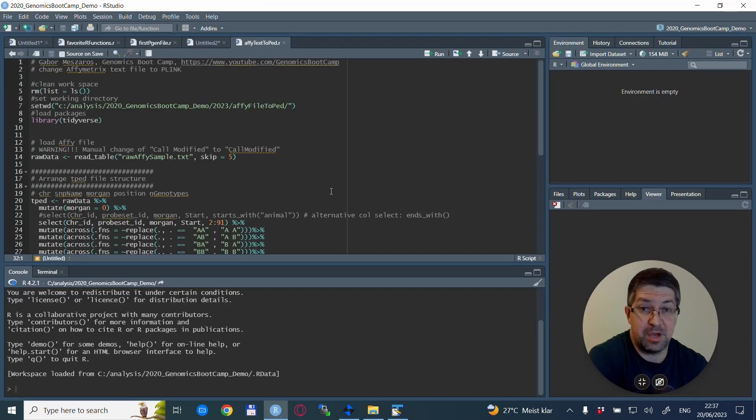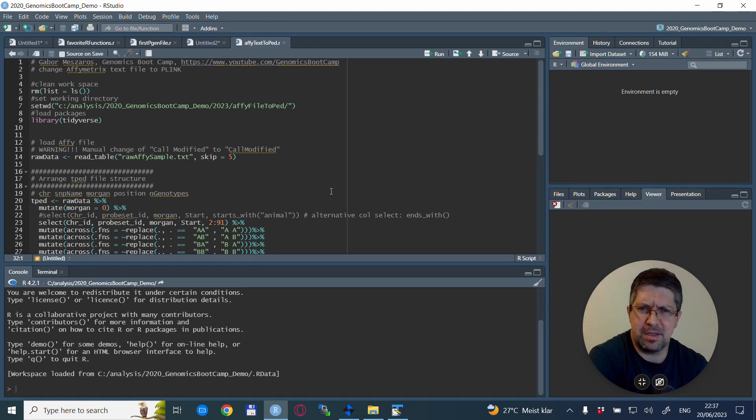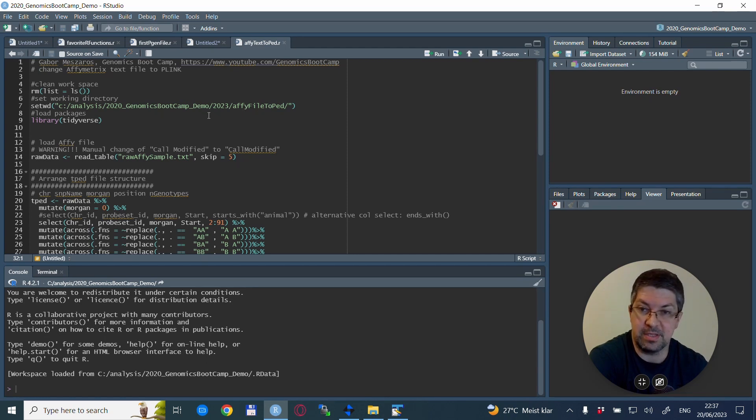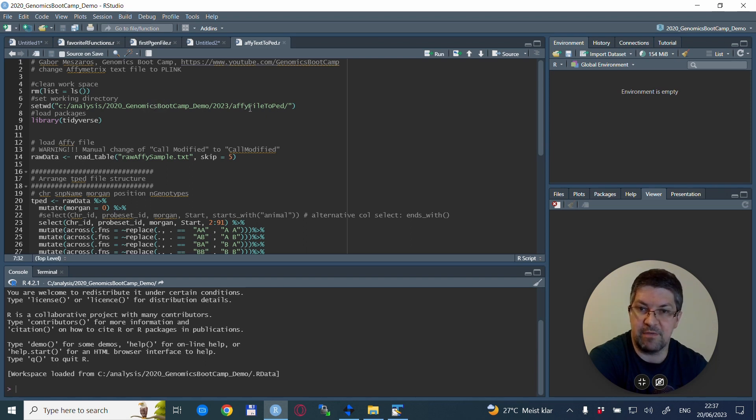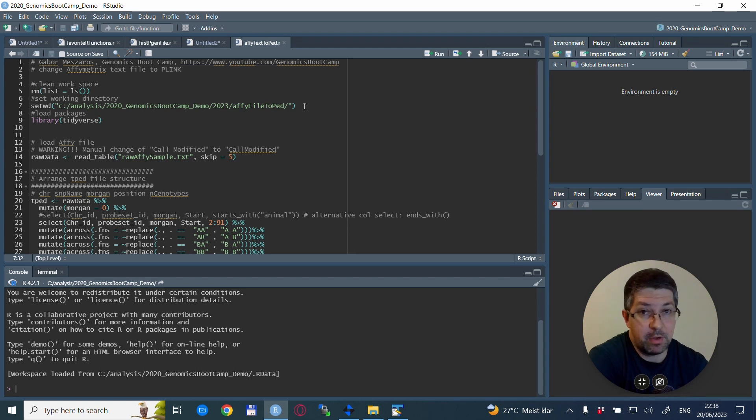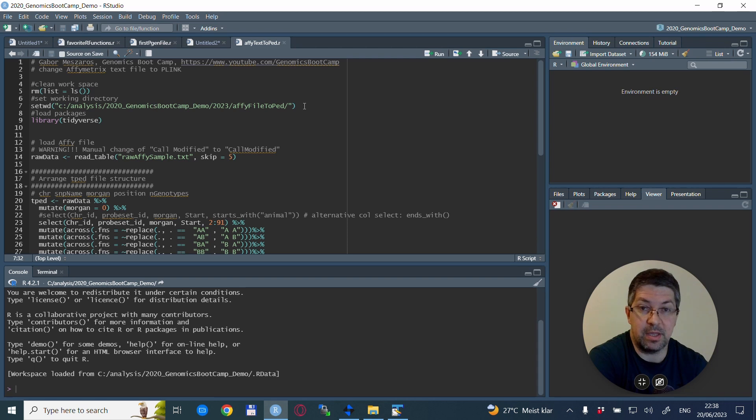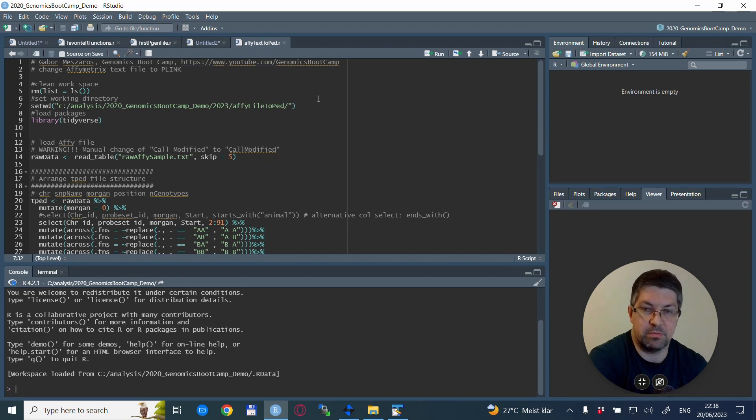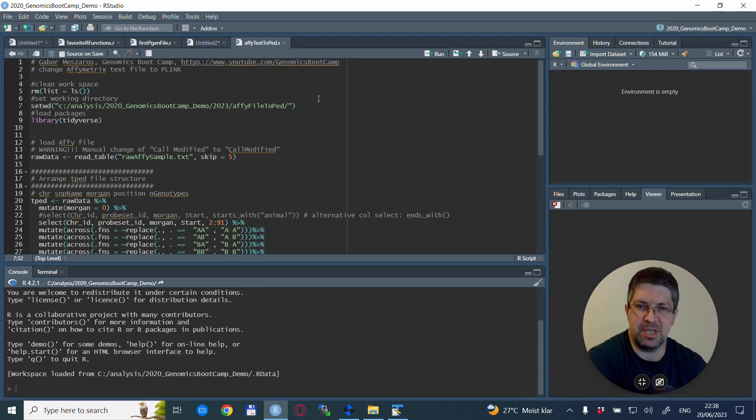So we are back in R, and the first thing that we do, as usual, is we define the working directory where this file is located. For me, it is this one with Genomics Boot Camp and Afi file to ped file. Well, I will upload this file into my GitHub page, so you can download this example file and do exactly this exercise yourself as well.